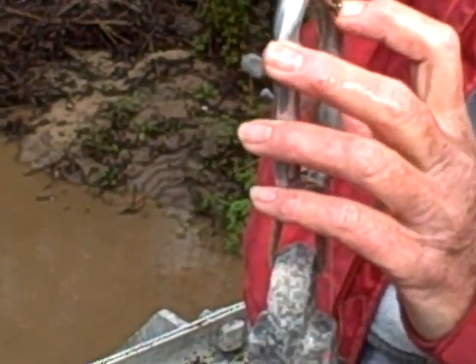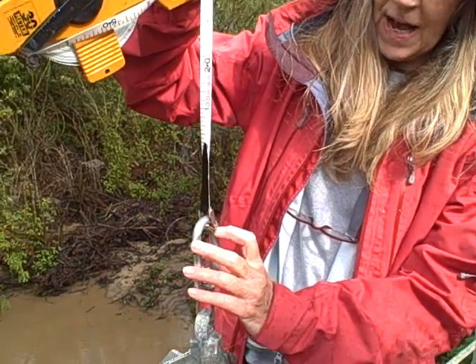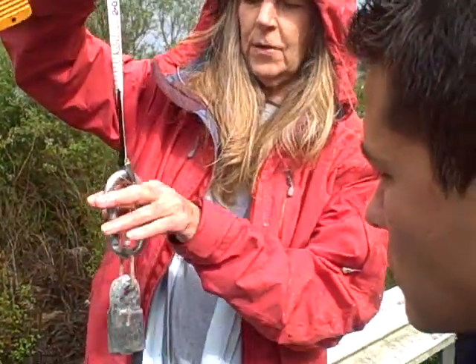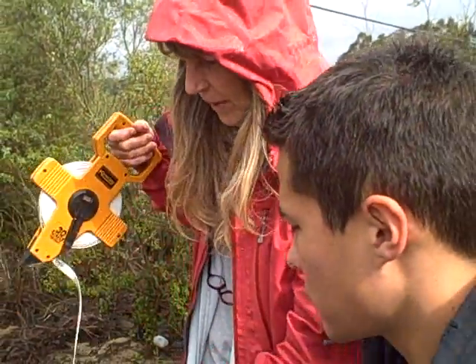But once it gets to where that is sort of submerged — well, ideally this is at the top of the water. And so if you've got the top of the carabiner showing, like that. We're talking millimeters here.